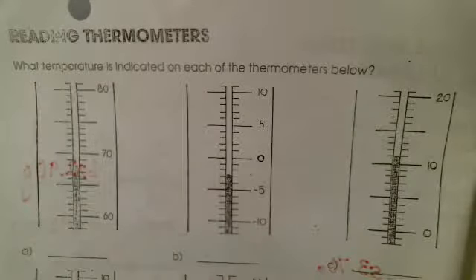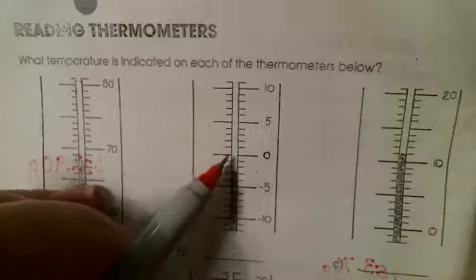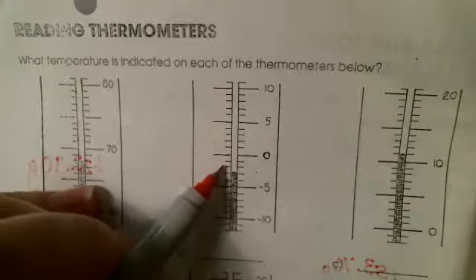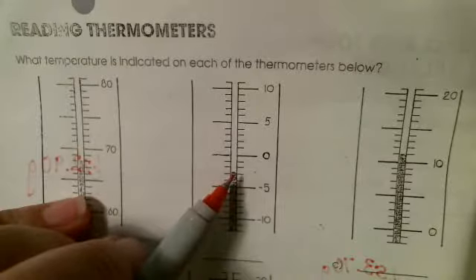So if we are reading the units place, then we need to estimate the next digit, which would be the tenths or the first decimal spot. Okay, so let's go ahead and read our number first and then estimate. So this line is -1, this one is -2, this one is -3. Now, as you guys can see, the meniscus is not quite at -3.